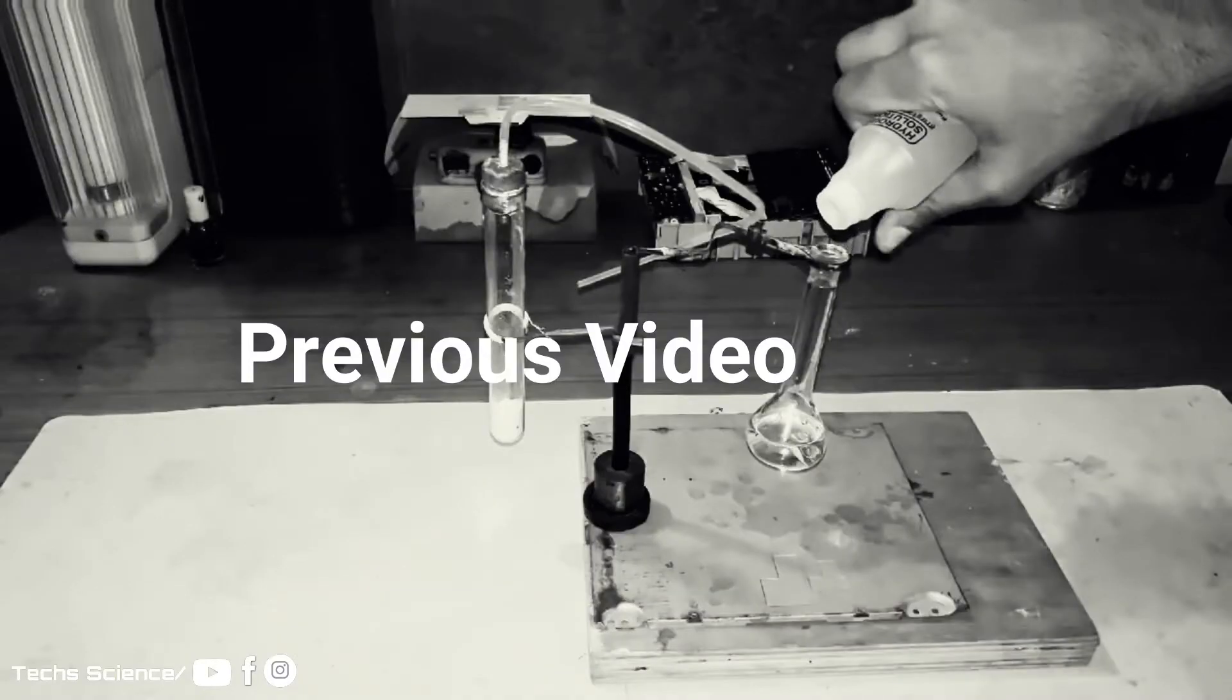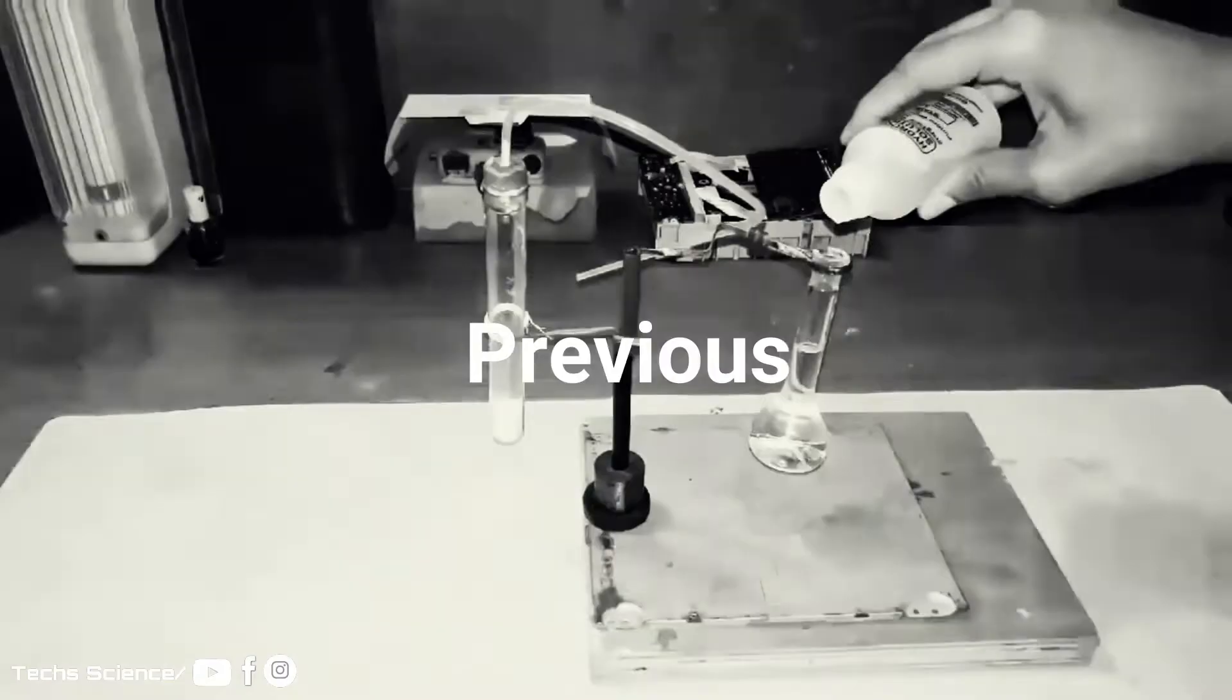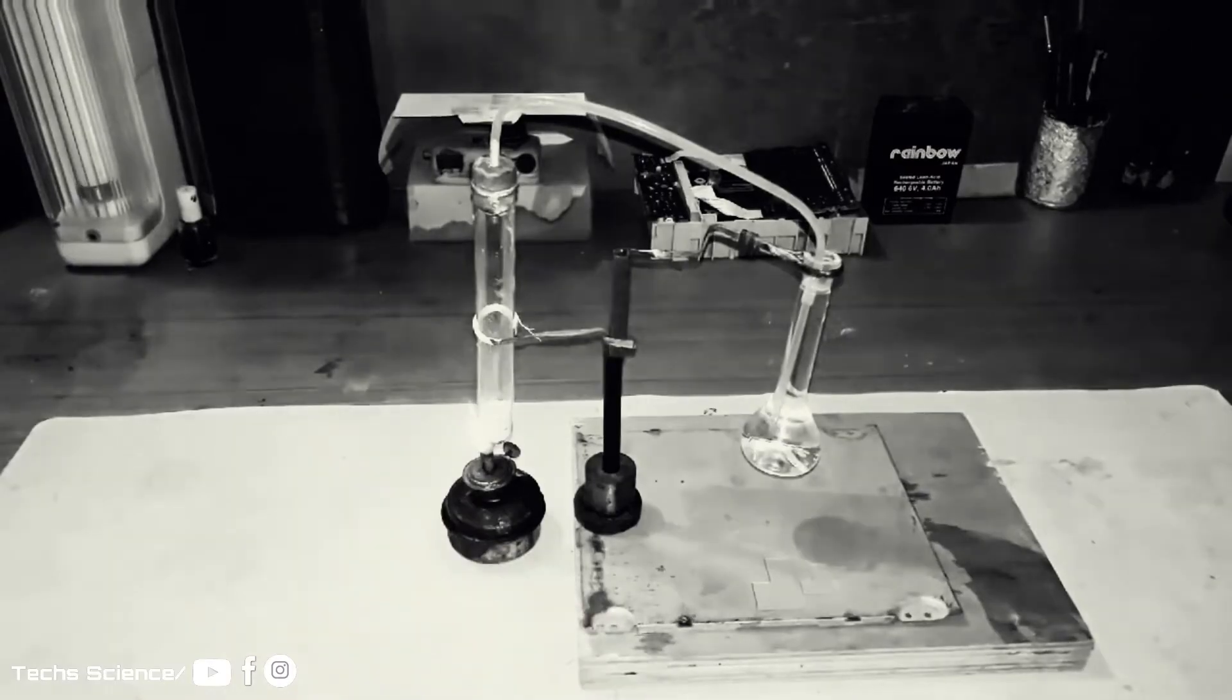In my previous video I made sulfuric acid, and people were demanding me to make hydrochloric acid.